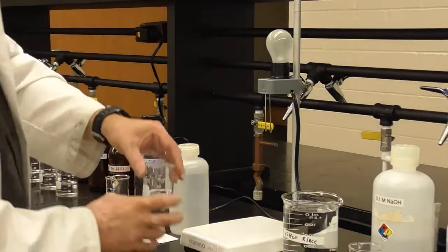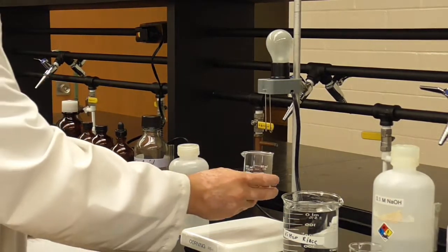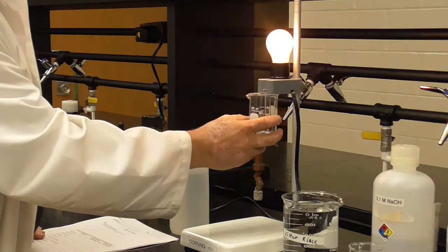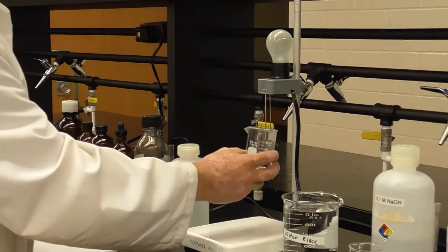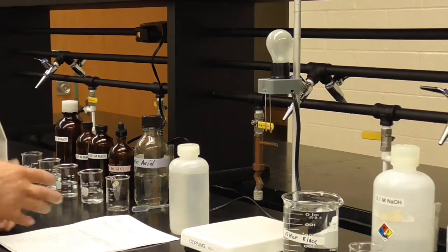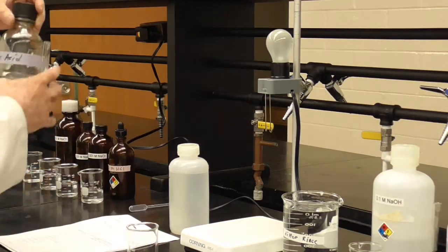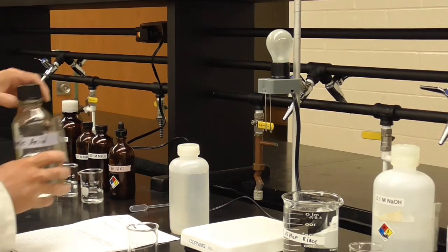And now my 0.1 molar, so the same concentration, but 0.1 molar hydrochloric acid. Very bright, maybe even brighter, I think, perhaps. So the nature of the chemical, what it actually is, will affect the ability to conduct electricity just as much as its concentration.